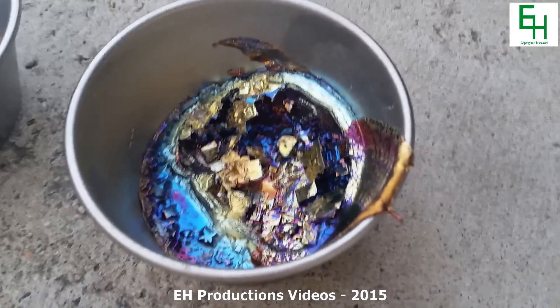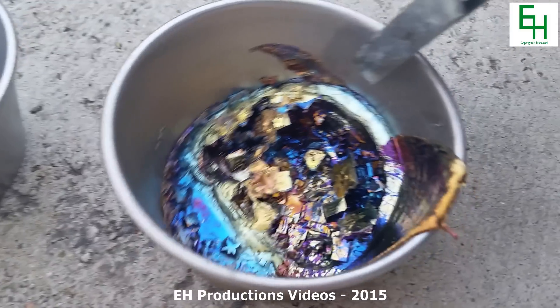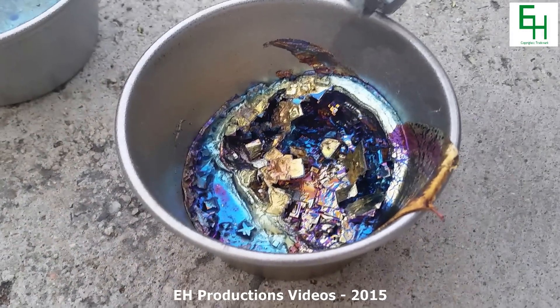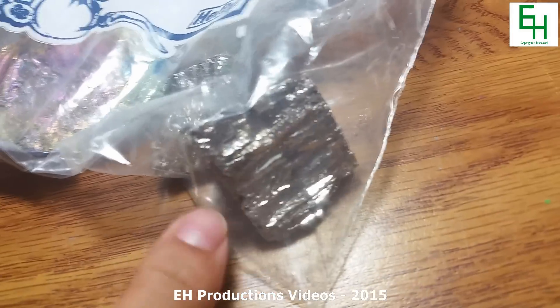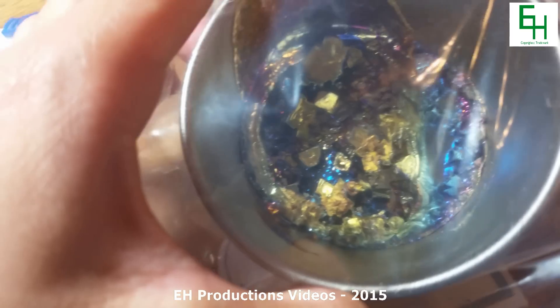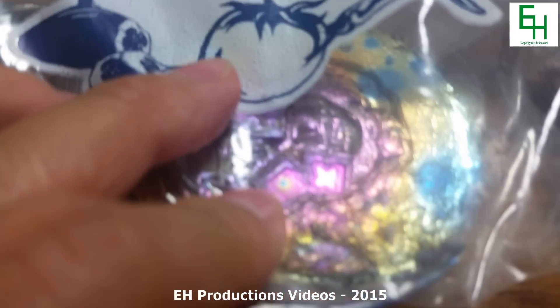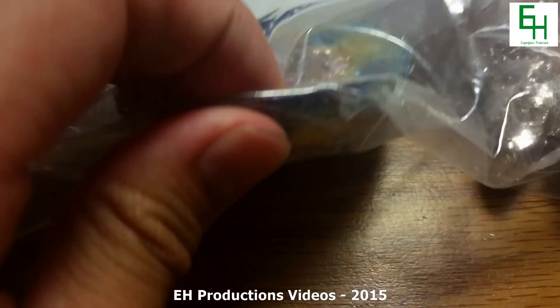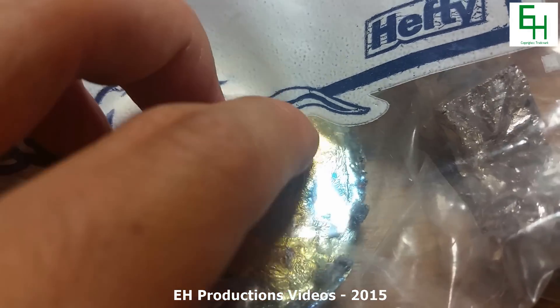Check this out — yeah, look at those beautiful rainbow-colored crystals that we made! Like square-shaped crystals. Pretty neat. As for the metal over here, we can let that cool down and it's gonna turn into crystals too, probably not as good quality as these. So we started with this bismuth metal, melted it down, and now it turned into these crystals. You can see those square crystals. I didn't pour any bismuth metal out of this one — I just kept it all here. It's not very thick but it's really heavy, and there are blue spots in the middle of the gold.